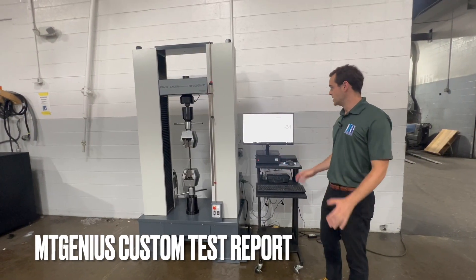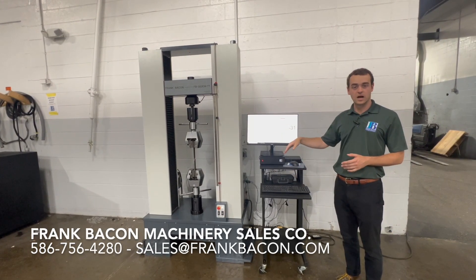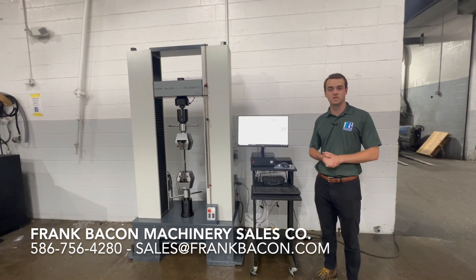Our test is now complete. We've got our test results here along with a graph. All the customer's results are already preloaded — yield, elongation, and more. Really nice machine here. Give us a call if you're interested in seeing a quote on it.